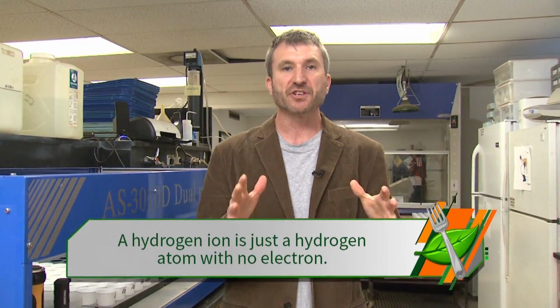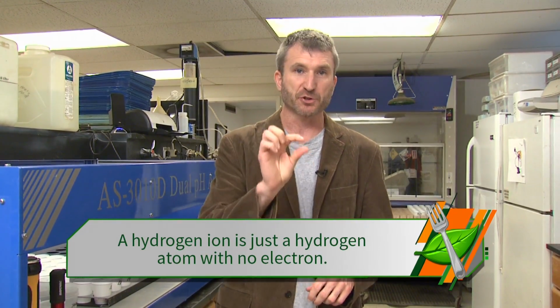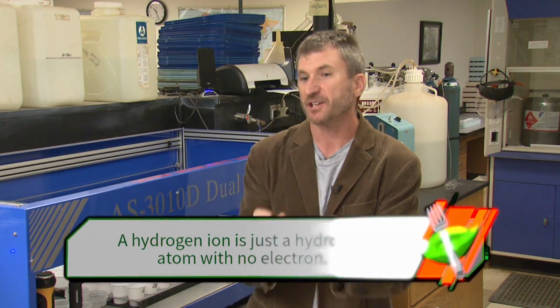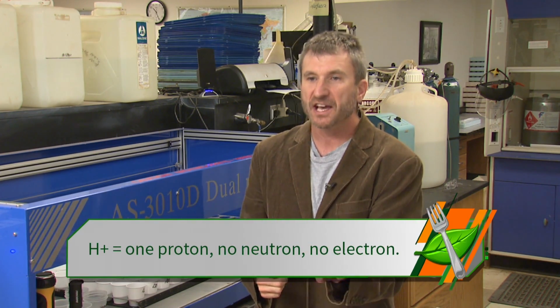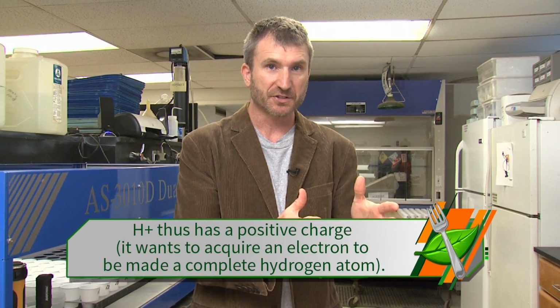And it basically works like this. It exploits the fact that a hydrogen ion is simply a proton. You might remember that a hydrogen atom is just one proton, no neutron, and one electron orbiting it. But if you take away that electron and you only have a proton left, that's a hydrogen ion. And since that proton is positively charged, a hydrogen ion is positively charged.